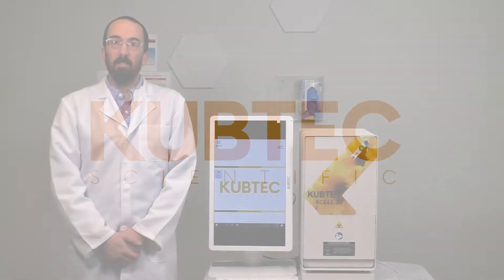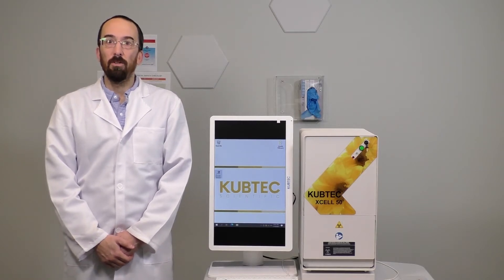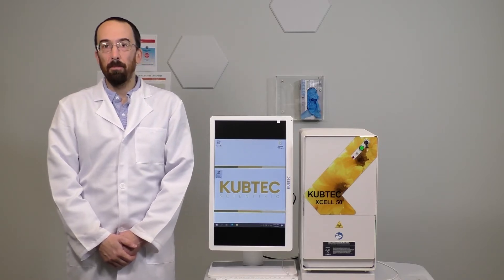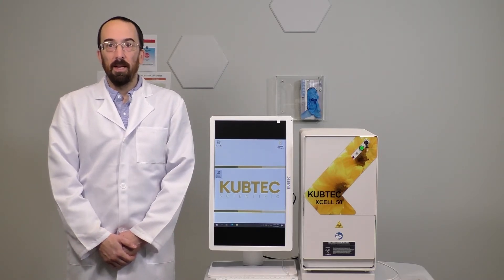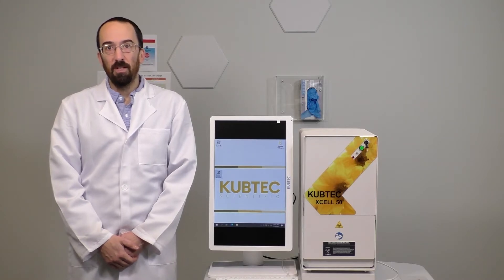Here we have the Cubtec XL50 Irradiator System, the most compact, cost-efficient benchtop irradiator available. It is designed to be placed directly on the bench, eliminating the need for transportation of samples out of the lab. It is a safe, effective alternative to chemical or isotopic irradiation. It can be placed next to your incubator, allowing you to save time and improve efficiency and throughput.